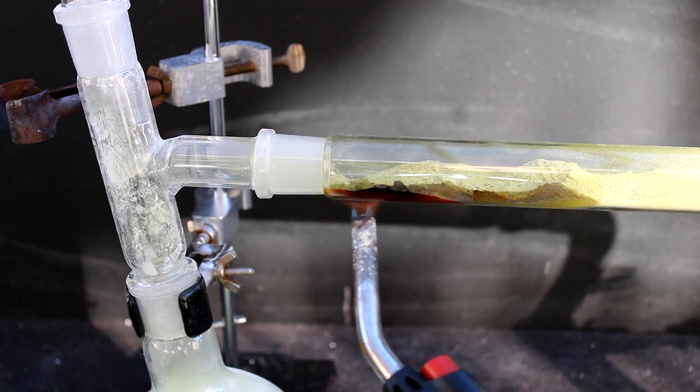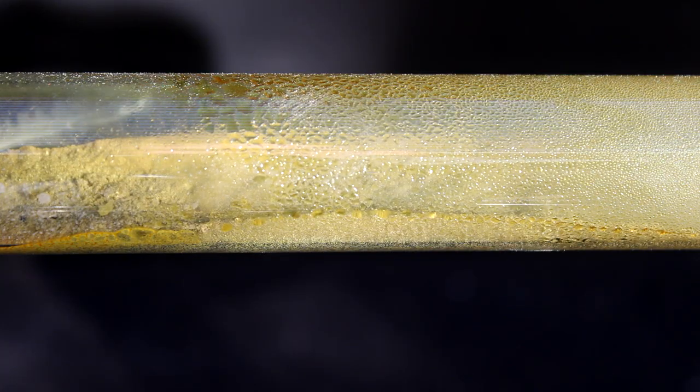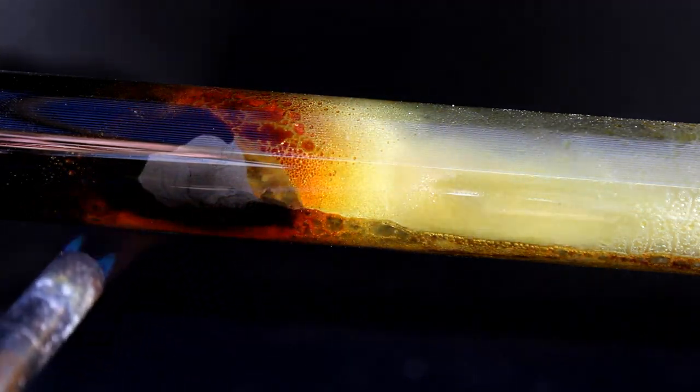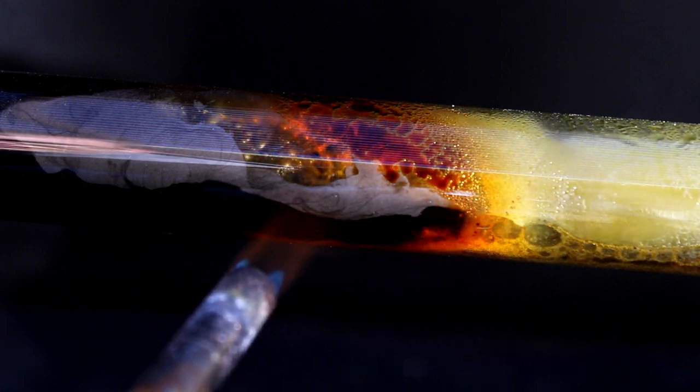As the sulfur melts and evaporates, it will react with the chlorine to produce two main chemicals: sulfur monochloride and sulfur dichloride. I really want the sulfur dichloride because it's a necessary ingredient in the synthesis of thionyl chloride, which I'll be attempting soon as part of a collaboration with Thisoid Laboratories, a German chemistry channel I highly recommend you check out. To help favor the formation of the dichloride, I made sure there was an excess of chlorine gas flowing through the system.